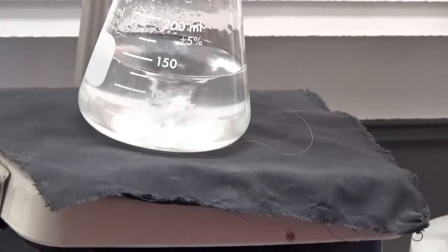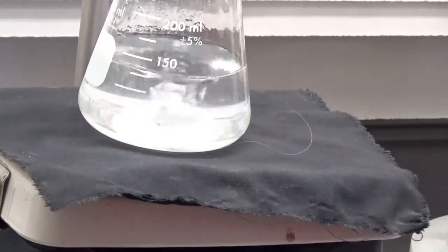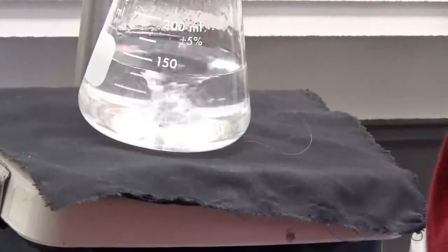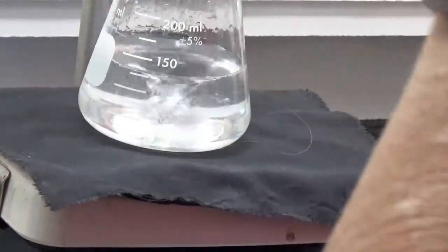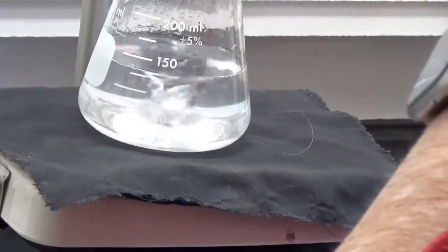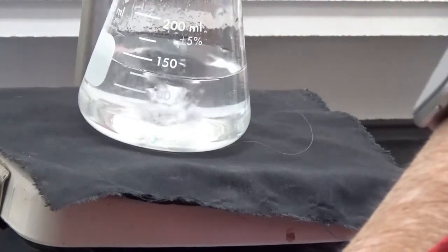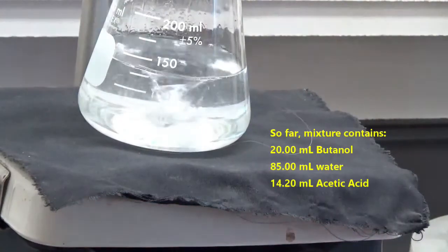One more drop. All right, there we go. This is 14.20. 10 more milliliters of water.